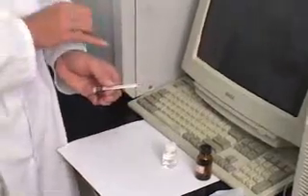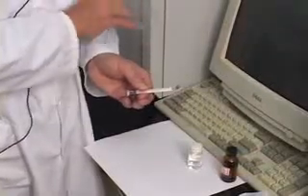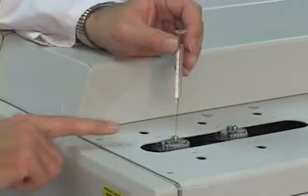Upon inspection, you will notice that there will be a plug of air before the sample and a plug of air after the sample. The sample is then injected into the GC using an injector port.